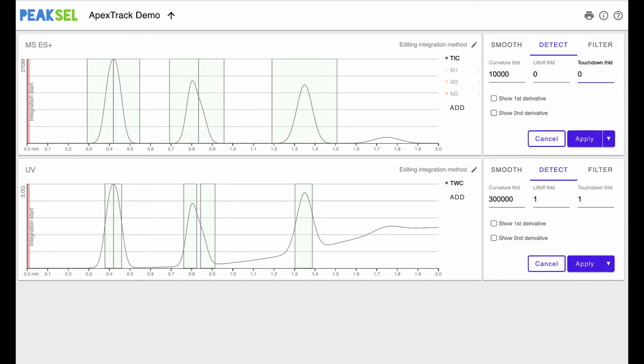Typical values for these thresholds are less than 1%, maybe even 0, but look at the chromatogram below. It has a baseline drift. This makes the inflection baseline of peaks tilted, resulting in a smaller angle at the inflection point, which in turn means that smaller tangent angles are acceptable and ApexTrack will go further left. So we'll have to choose a higher threshold to end the peak sooner.